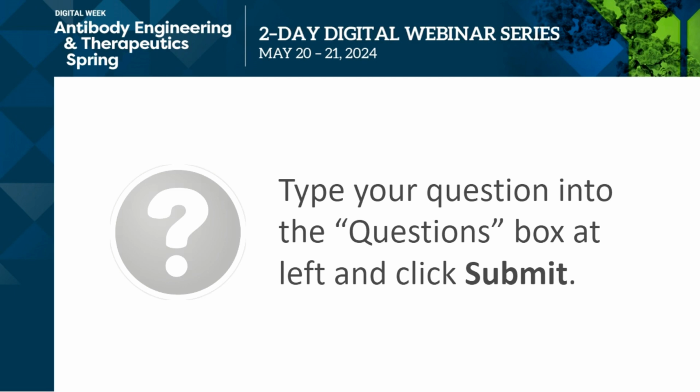Yes, we can. Perfect. My next question, I think, is directed at you as well, Indrani. In SPR, there is a direct correlation between RU and the amount of mass bound on the surface with a distinct formula. Is this also true with the nm shift in BLI?